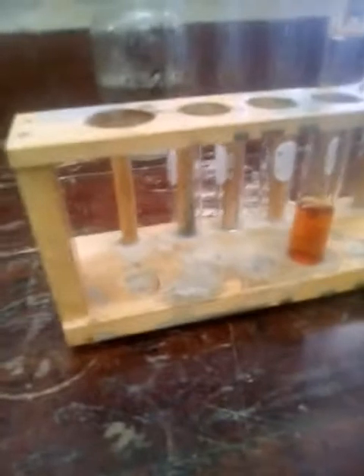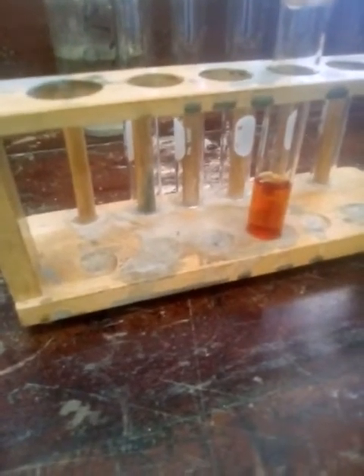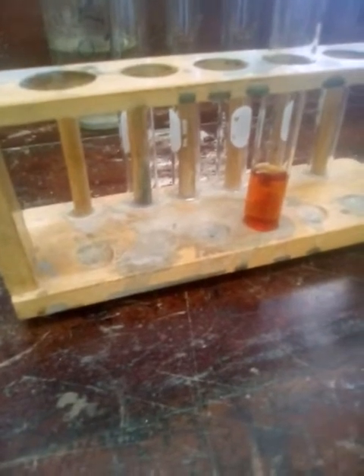So we can actually see changes already. We're going to shake it gently, and we observe. We can actually see changes already. So we're going to observe that for a short while. We're seeing a color change.